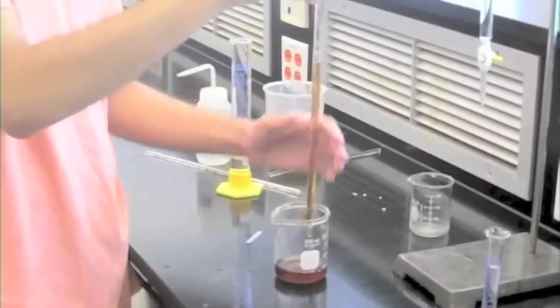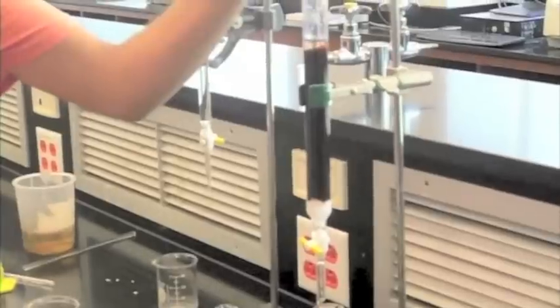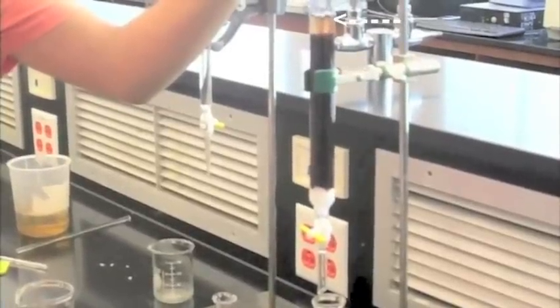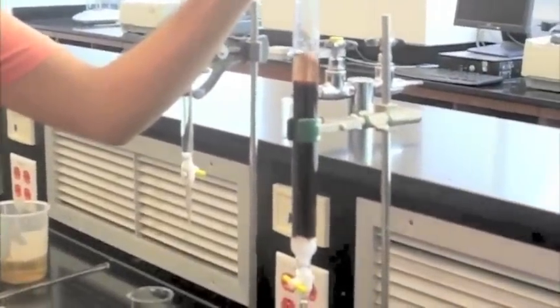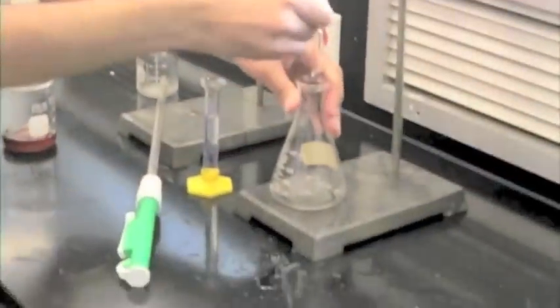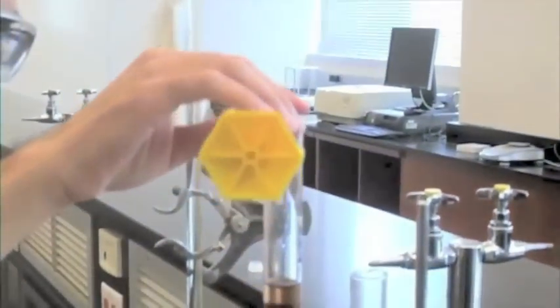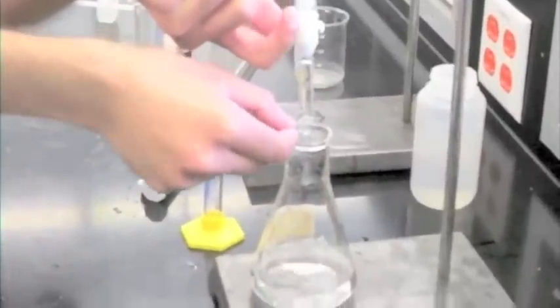What you're about to see is a demonstration of doing this procedure incorrectly. Instead of letting it run down the walls, the solution here is being poured directly into the resin. Notice how the resin particles are jumping up and swirling around in the liquid. Though this may not severely impede your results, it's a technique you should avoid. Have a 250 milliliter Erlenmeyer flask below the column, open the stopcock, and let the effluent collect at around 2 to 3 drops per second. After the liquid level is barely above the resin, start adding 5 to 10 milliliter increments of deionized water until the effluent becomes neutral again. The collection in your flask is now ready for titration.